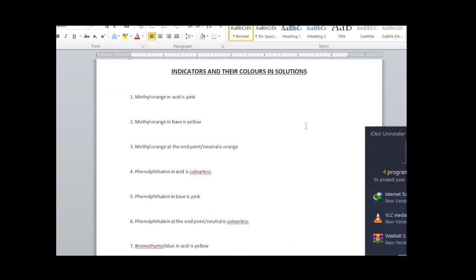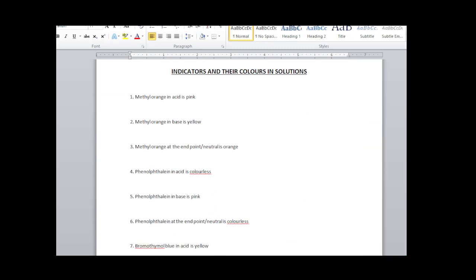Now in the practical question, you'll be having the number one question to be quantitative analysis, that's volumetric analysis or titration, and then number two is going to talk about salt analysis, which is the qualitative analysis. We're talking about the quality or the properties of the salt that is going to be given. And then number three question is going to be random questions. It is also practical questions, but it will come in form of theory. So they could ask different types of questions.